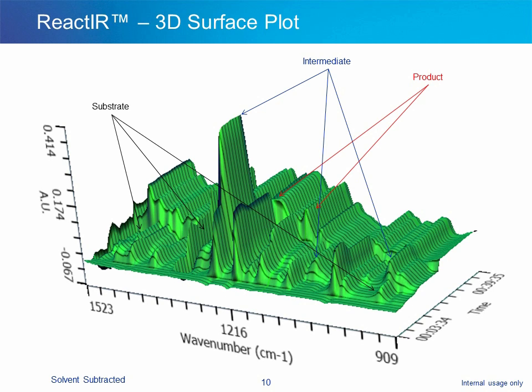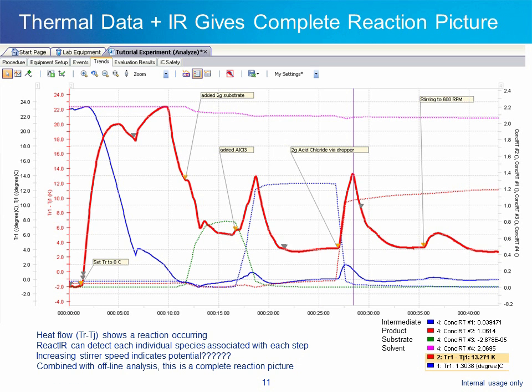We can now monitor the changes in concentration for these components. We can bring these infrared trends into iControl software and view them along with the EasyMax trends to get a complete and thorough understanding of the reaction dynamics. While TR minus TJ indicates the exotherm of the reaction, the specificity of the mid-infrared spectrum shows us the species that were formed with each step. The CONCERT algorithm was used to automatically deconvolve the data to provide concentration profiles. CONCERT also provides mathematically calculated pure component spectra, which can be used to confirm the structure of the intermediate species and understand reaction mechanism and pathway. The profiles can also be used to calculate the kinetics.